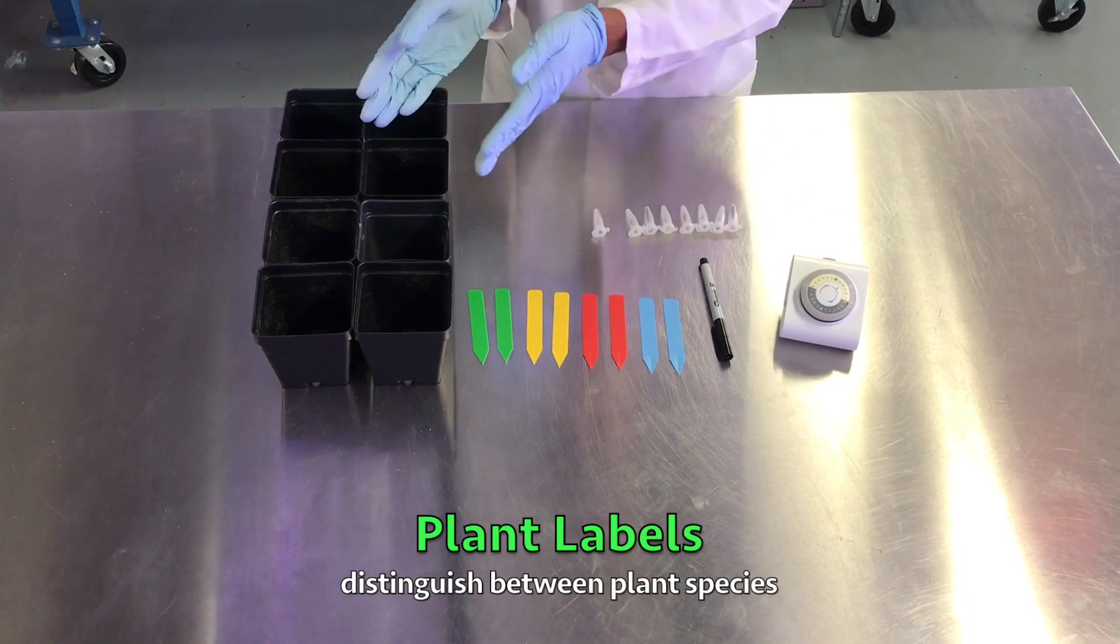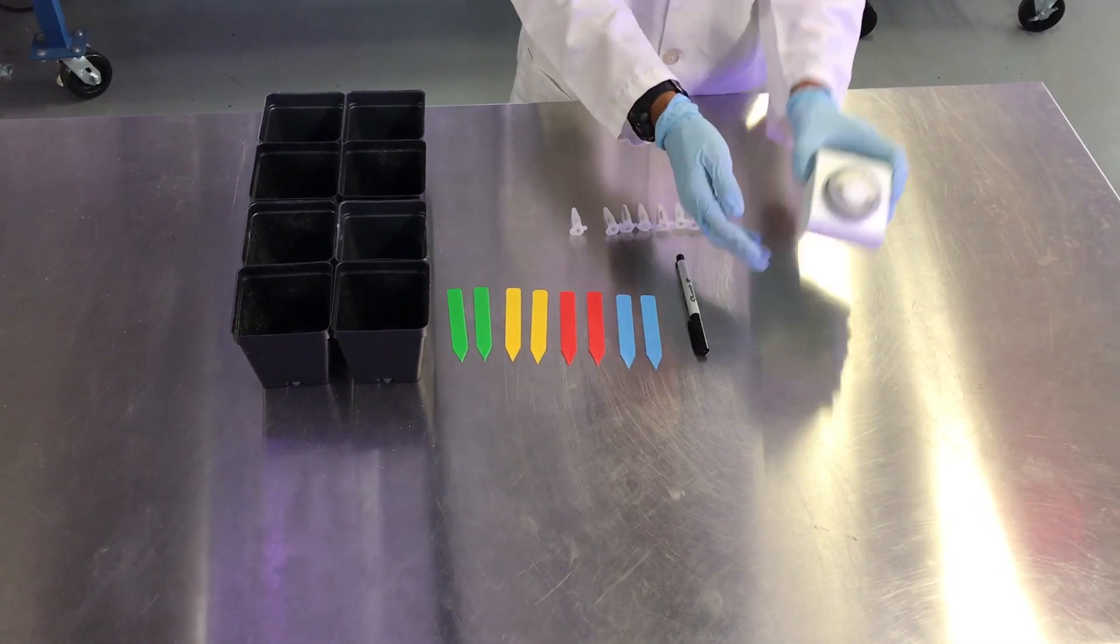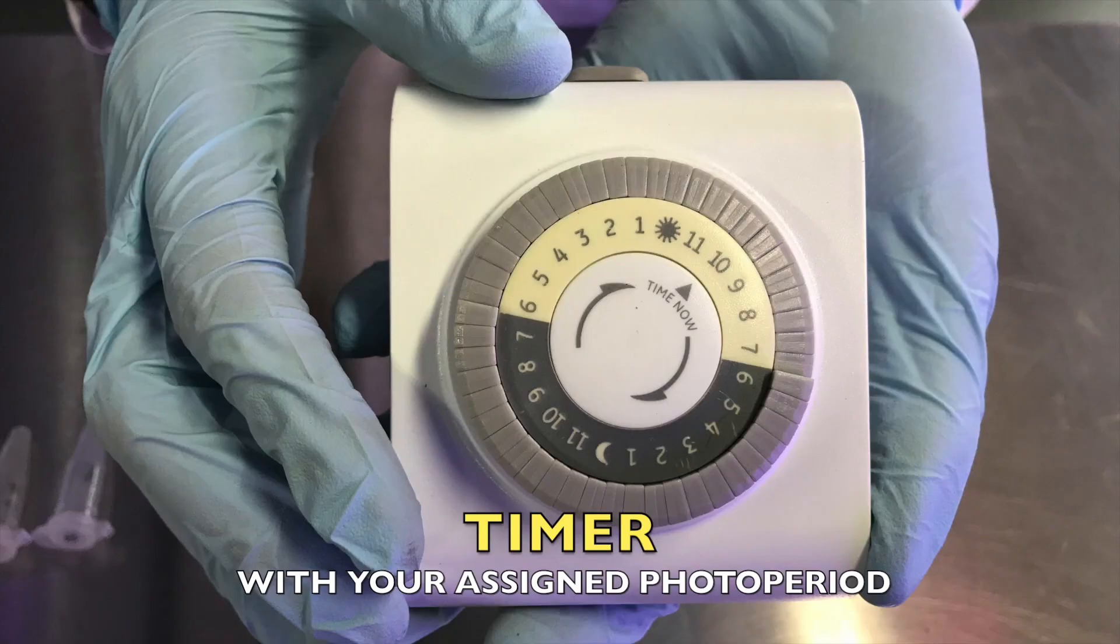Plant labels, two of each color to distinguish the plant species, and a timer set to be on with your assigned photoperiod.